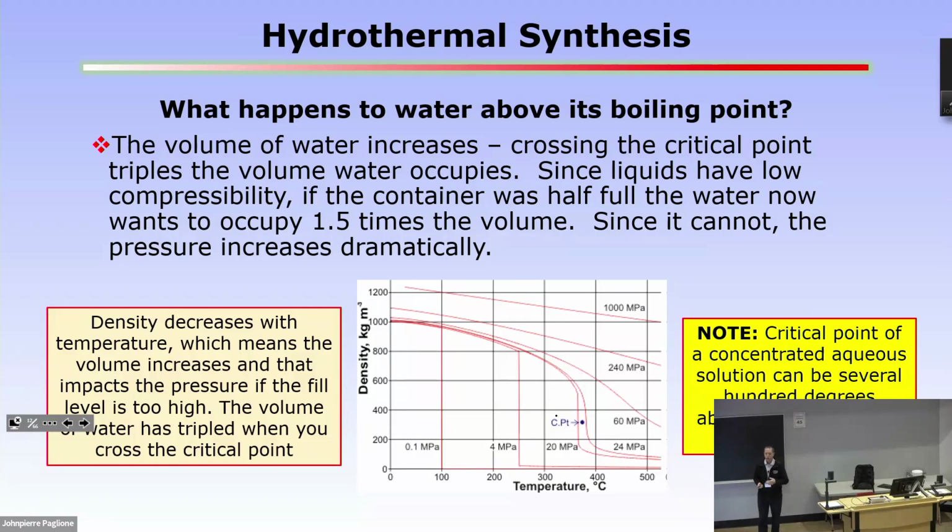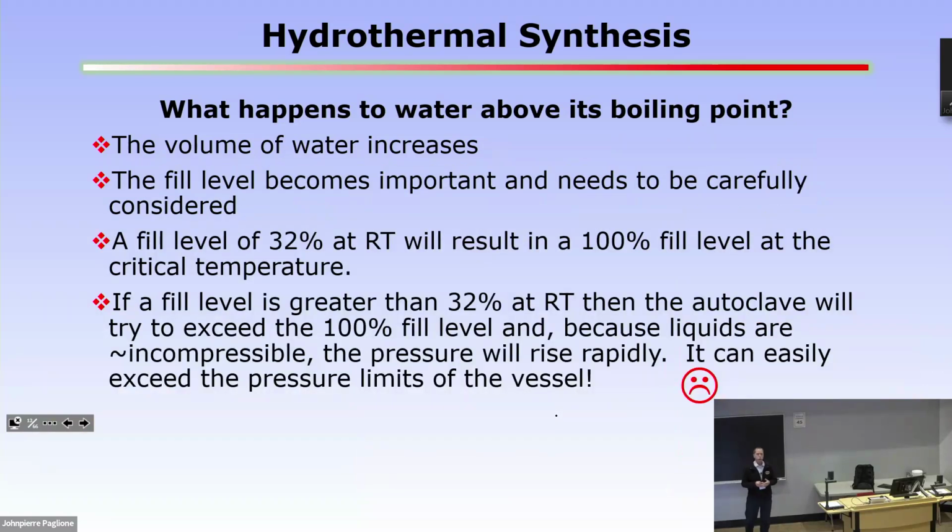But anyway, the point is, if you fill your container to 32% at room temperature and you hit the critical point, you're now full. That's okay. If you're more than full, then maybe your pressure vessel is not going to make it. Or you anticipate that and you've planned for it.